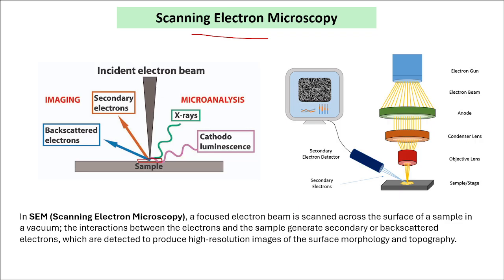Now, suppose you have a nanoparticle suspension that is in aqueous state, what you need to do is take a small glass slide. You need to cut this glass slide using a diamond cutter and drop that nanoparticle suspension and let it dry in a desiccator. Dry. It should be dry.